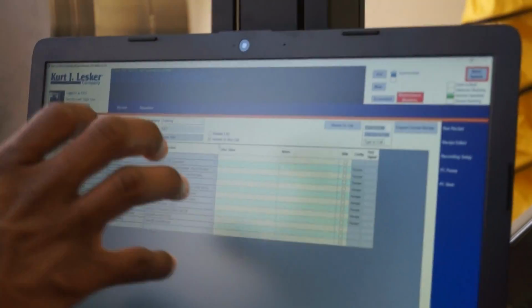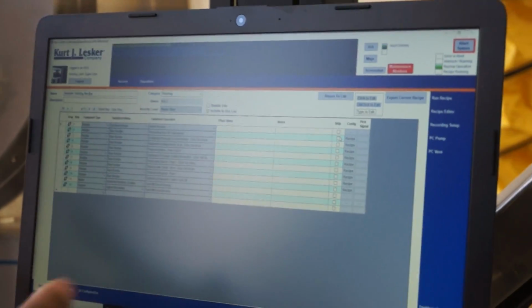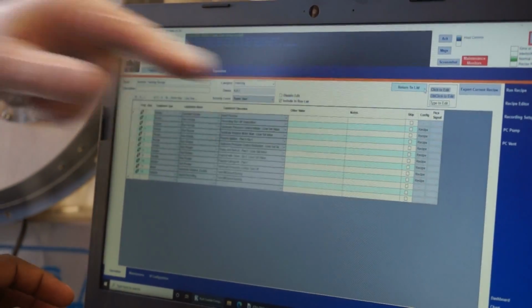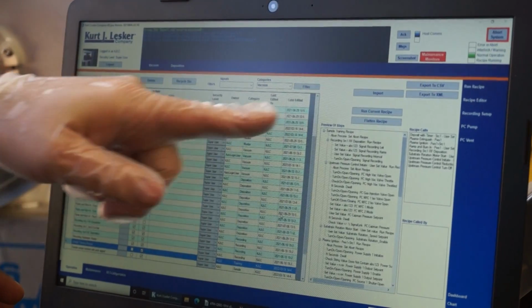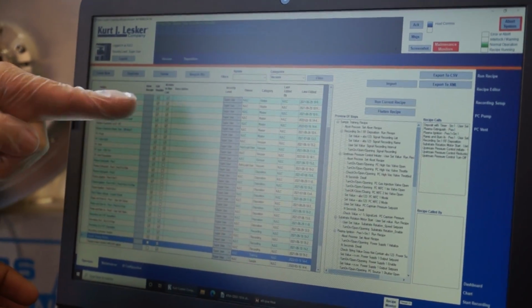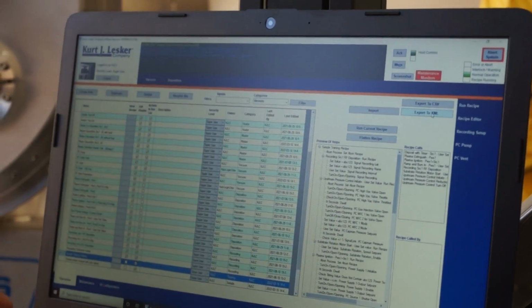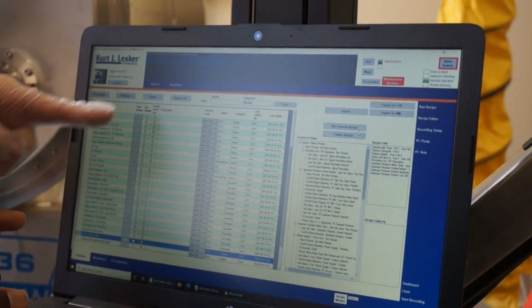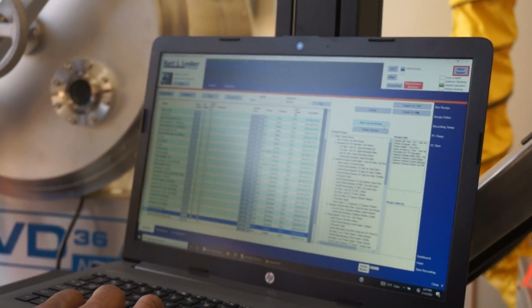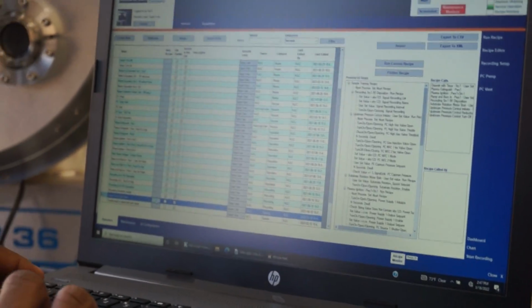Run recipe is being able to be run from my list. So if I wanted to just run this recipe as it is, what do I click on to do so? If you go return to list, this is highlighted. You can click run current recipe, and it'll run there. If it's in the run list, it'll show up in here. You click run recipe. So this is how you run recipes that aren't included in the run list. Oh, so I'll just click run current recipe and then it automatically runs. Yeah, automatically run.